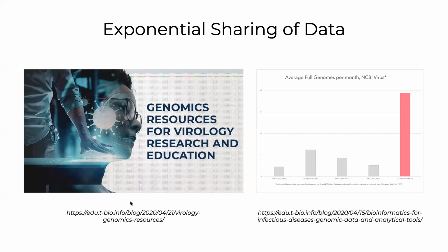For example, there are techniques that make long reads, and those long reads could be anywhere up to 5,000 base pairs long, or today even longer. Nanopore, Oxford Nanopore, PacBio produce those long reads.